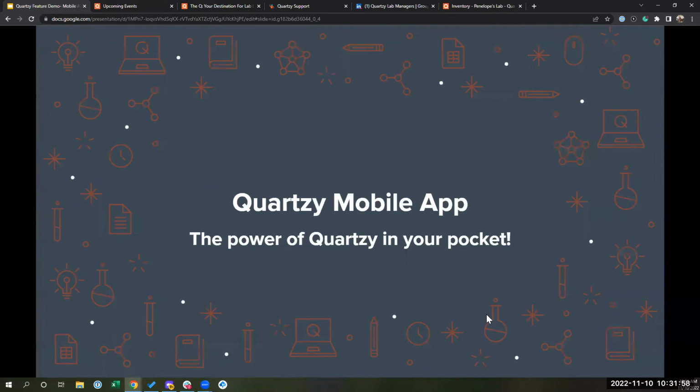Do we have any other questions before we jump into the mobile app itself?